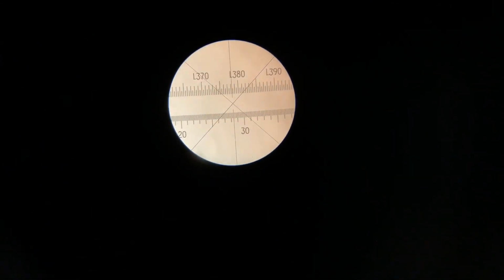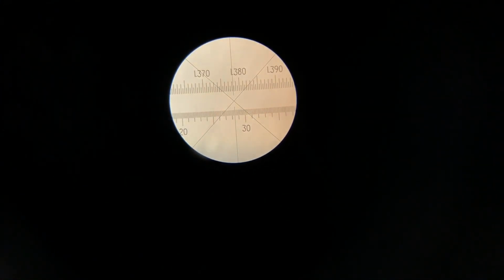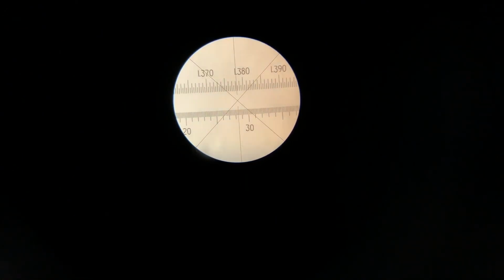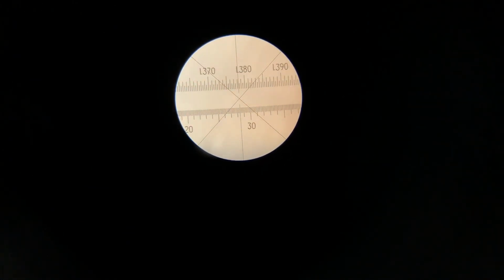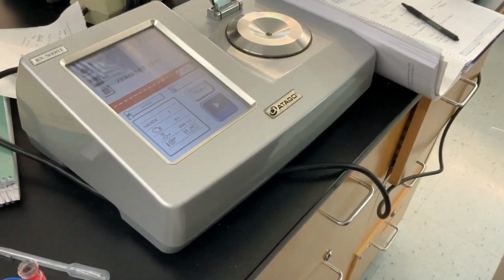So where that line is, 1.378, it's directly in between 1.3780 and 1.3785. And so what we can say is that it's 1.3783. So that's our last digit of uncertainty, that number 3, but that's what we're going to go with. So 1.3783.